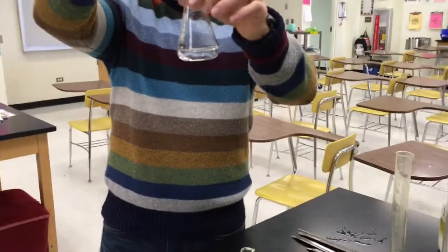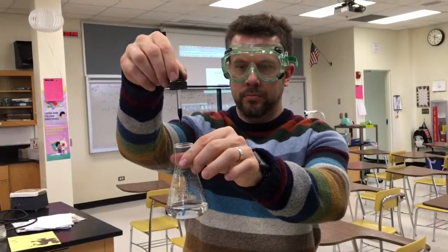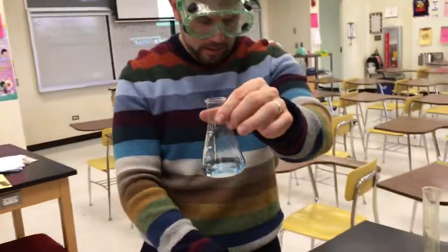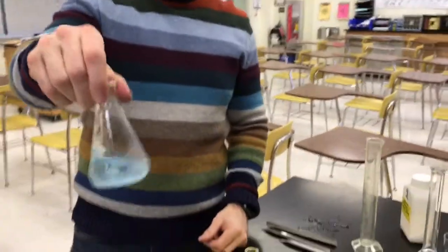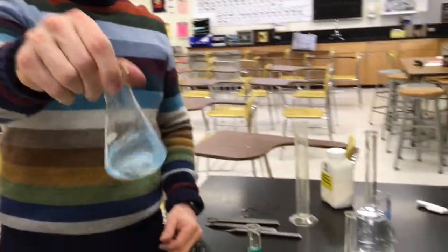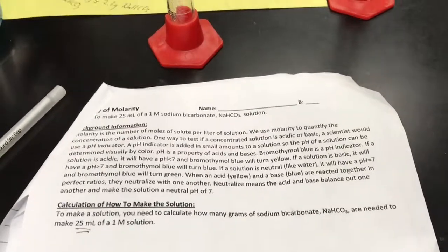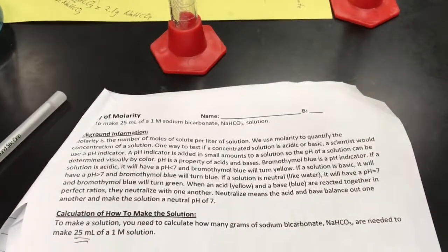Bromothymol blue. I believe it calls for 5 drops into my Erlenmeyer flask. So, boom, boom, boom, boom. Generally you want to hold it straight up and down. All right, swirl it. And as I mentioned, it's got a blue color in the presence of base. All this information is in your background, okay? So it's a pH indicator.